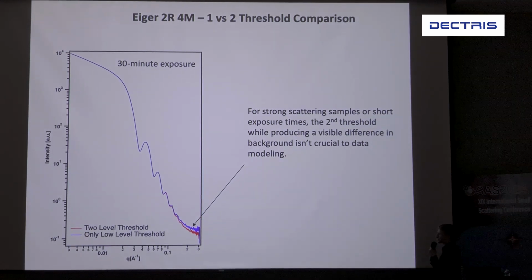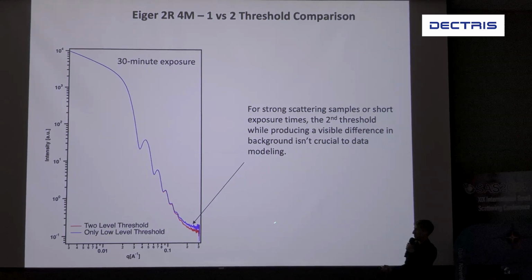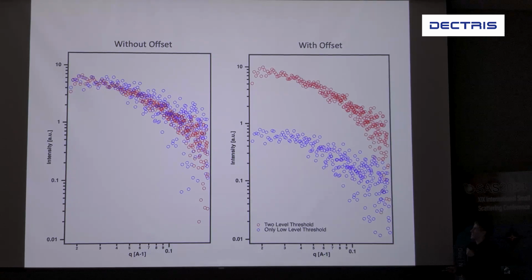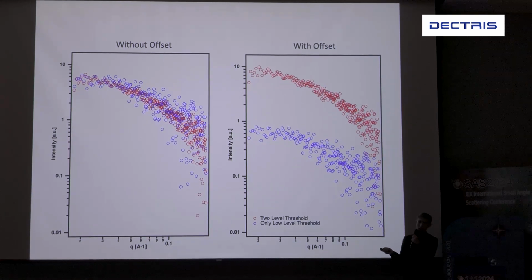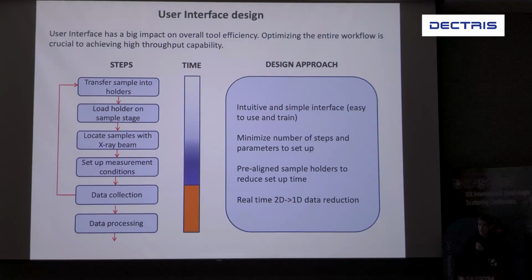So on an actual sample, you can see that for very, very strong scattering samples, it maybe doesn't matter as much. But on an in-house system, it does. Okay, so this is for another sample that was run for 30 minutes. If this is a user sample, and that's the buffer, suddenly the dual threshold kind of matters. So you can see here that this is with only 1 threshold, and this is with 2, and the data is noticeably cleaner. And it actually is something that's very important on an in-house system because, unlike synchrotrons, which are only run for a couple of seconds, we have to run for multiple minutes.